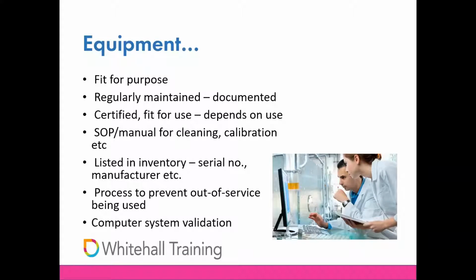Now, this requires an appropriate level of user acceptance testing to show that the equipment is fit for its intended purpose. What this level is going to depend on is the equipment and what it's being used for, but the lab will need to justify the testing regime it chooses. So the testing should be documented again, and the records need to be retained. There should be a clear date on which the equipment was judged fit for use.